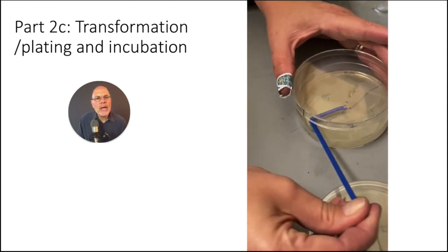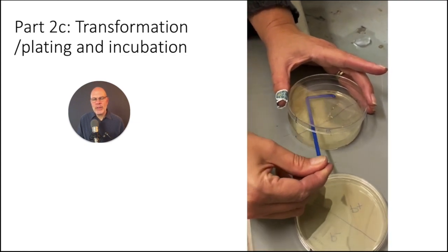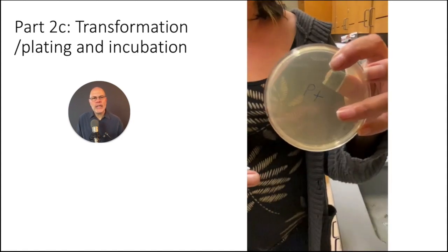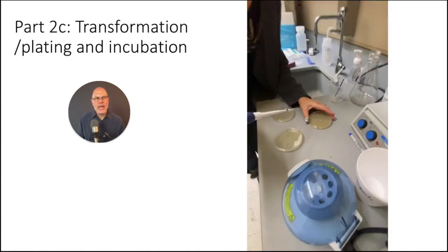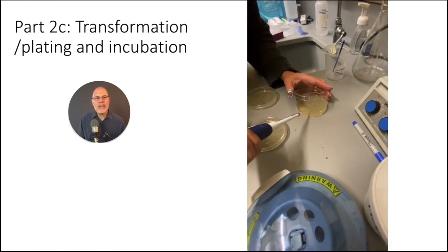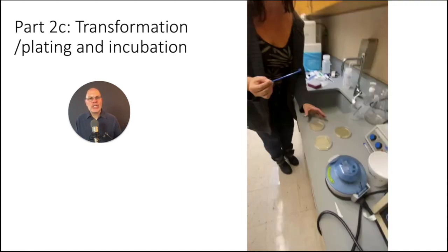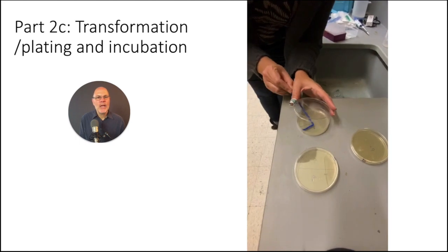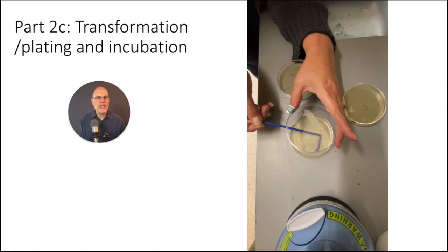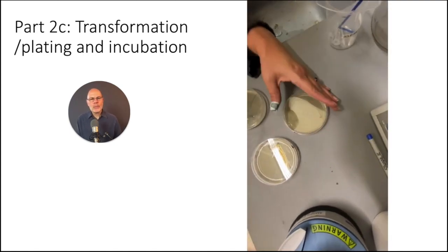It looks like these are all the P- bacteria. So she's going to do the P- on this plate and then the other plate. And now this is the plate that has the LB and the ampicillin and the arabinose. So she's putting P plus on that. Let's see what she's going to do next. She's going to take the spreader. I've got her sped up here, and she's spreading this out. She's spreading out the P plus on all 3 plates. So spreading out the P plus, and then she's doing it again.